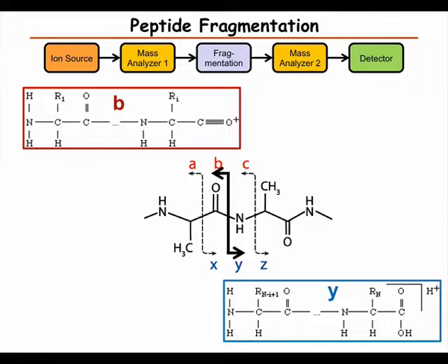It is the weakest bond. In collision, when you have collisional energies, the energy has time to disperse throughout the molecule, and then it breaks at the bonds that are weakest. That's why in collisional dissociation we also have such large intensity differences depending on which amino acid is on both sides.